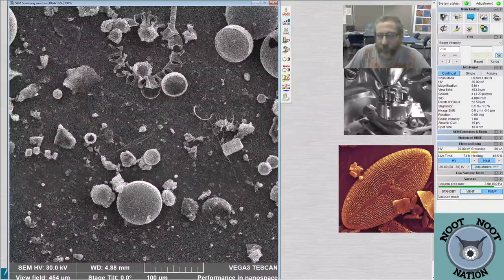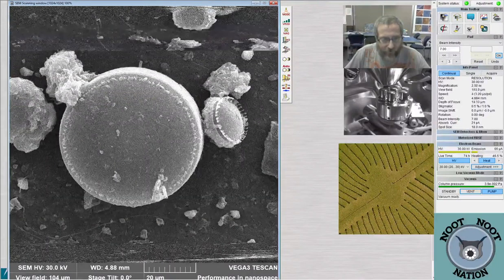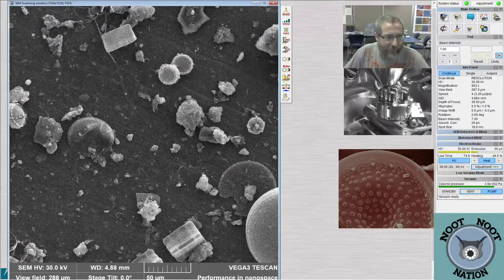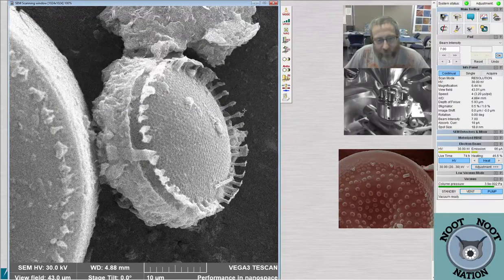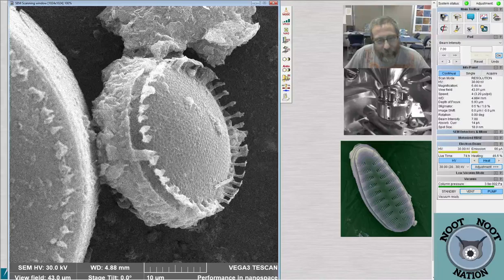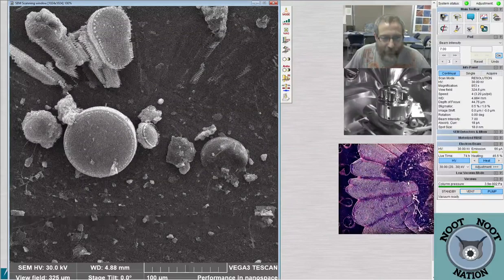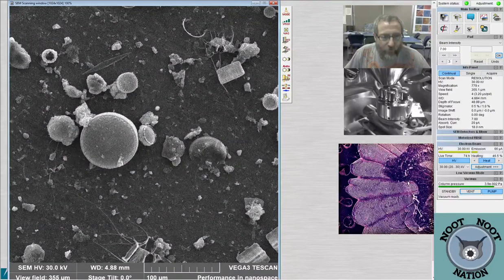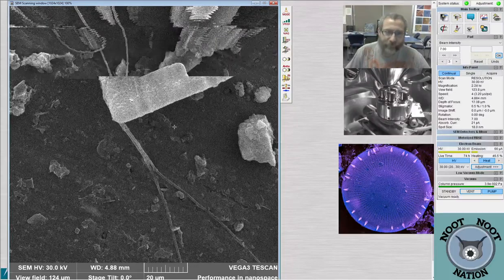There's a pretty neat view of this thing. Oh, it keeps doing this thing where I click and then I zoom in, and it started zooming in before and it thinks I clicked. Yeah, they can see this sort of ring of spines that are up here, like well above the surface. It's a pretty neat looking view. And if it wasn't covered with junk, I probably would take a picture of that one. So I think I've been seeing that one on the light microscope, because they stick up just far enough that there's like a hint of that crown if I get it at the right angle on the light microscope.